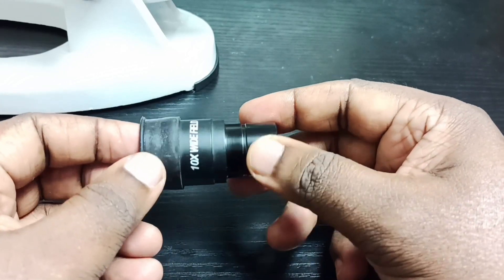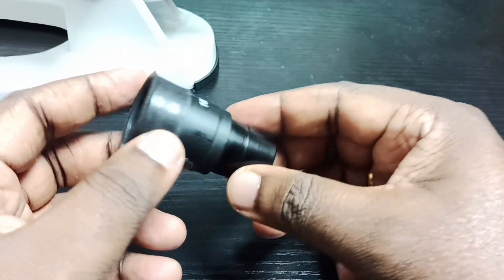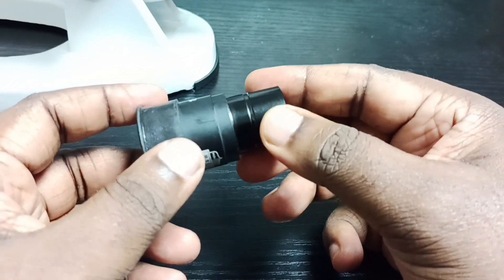So this way we can open this eyepiece lens, clean it, and then put everything back. I hope you enjoyed this video.